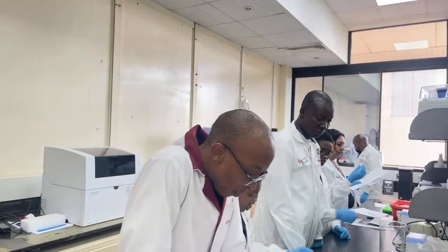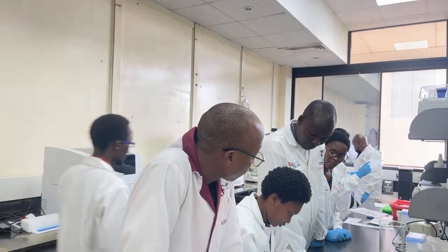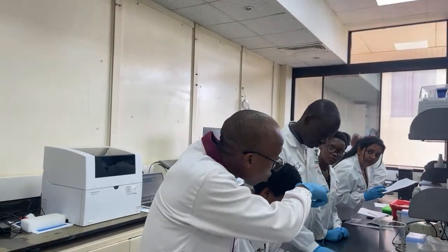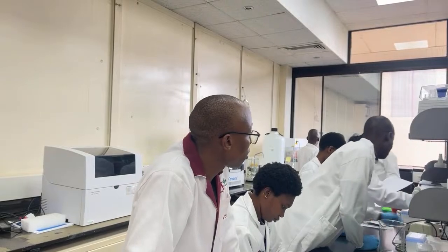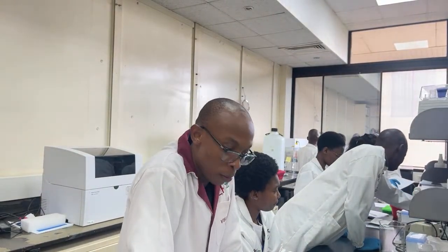So we should be on step number 14. But this is just the spin column there. You can just put your stuff in that centrifuge, just to collect for 5 seconds, just to collect anything from the cap.